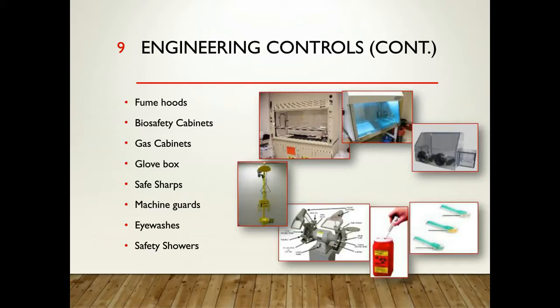And make sure that you don't let people install drench hoses and call them an eye wash. A drench hose is not an eye wash. An eye wash has to hit both eyes at the same time, and there are specific standards that ANSI has put out that specify how an eye wash should be installed, how a shower should be installed, and those standards should be followed when you're looking at your redesign.